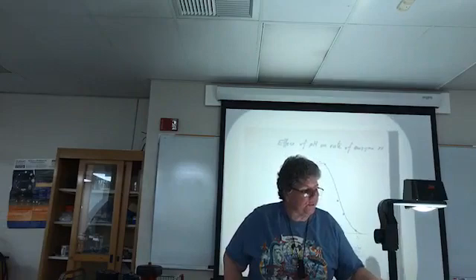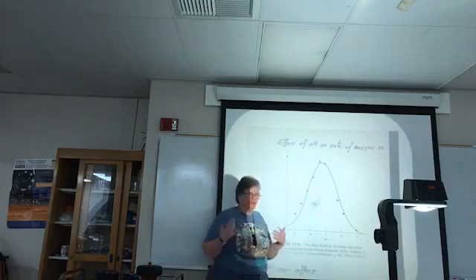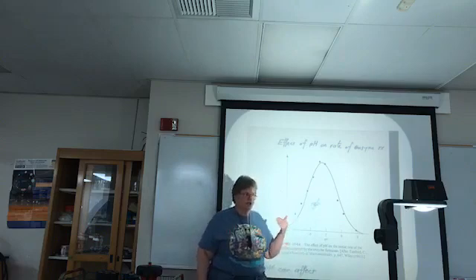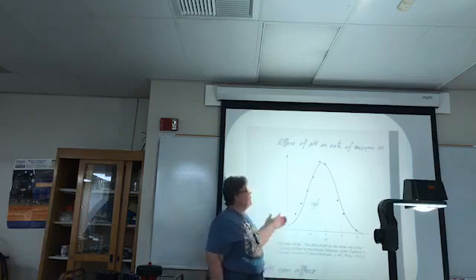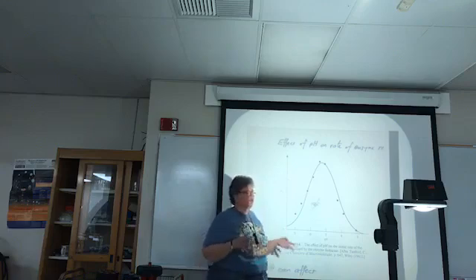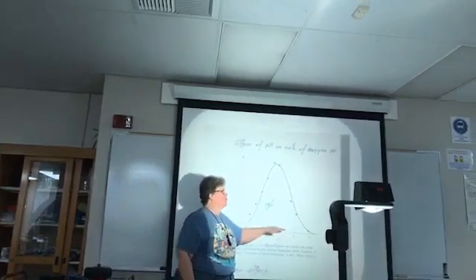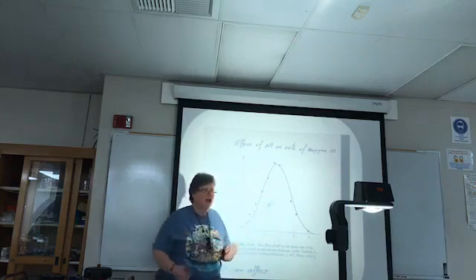One of the next things you're going to do is measure the effect of pH on the rate of a reaction. So you're going to be doing the same thing. You're going to be taking your substrate, your pyruvate, you're going to be taking your NADH, mixing them up with buffer, adding in the enzyme, and this time your buffers are going to be different pH buffers. So you're going to be measuring it at 6.5, 7, 7.5, 8, 8.5, etc. So a range of different pHs, and you're going to be measuring the velocity versus pH. So you should have a greater velocity at some pHs and a lower velocity at other pHs.